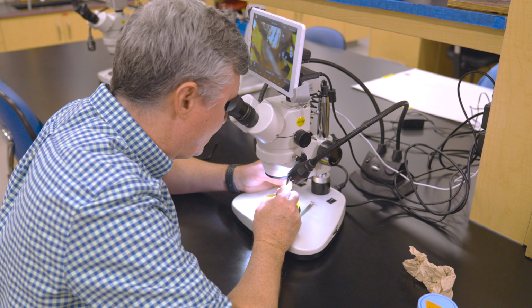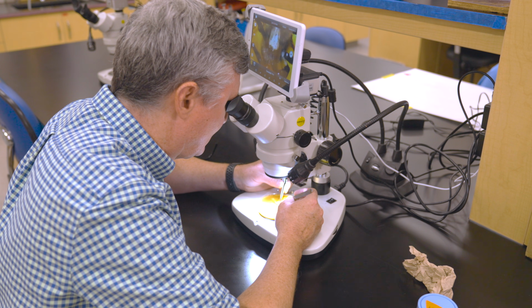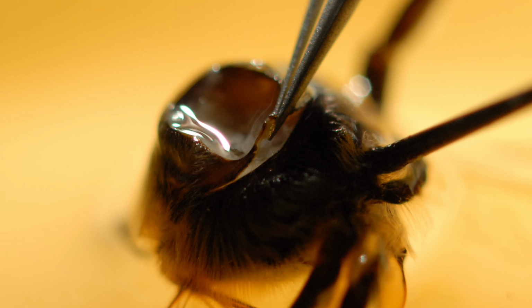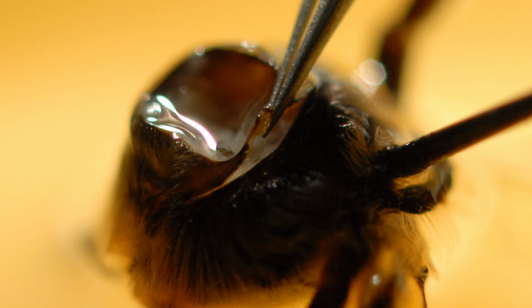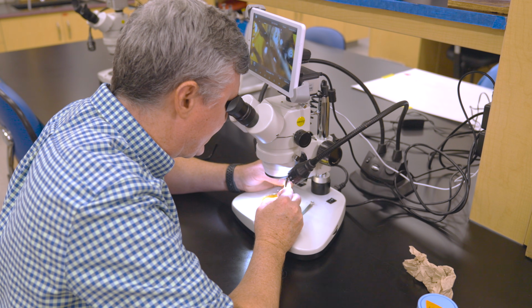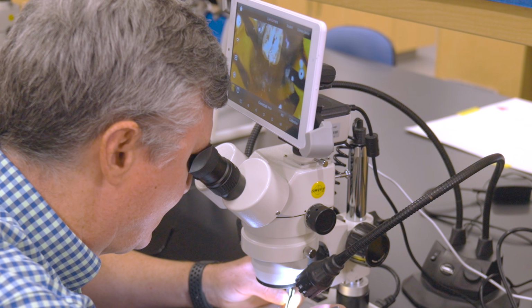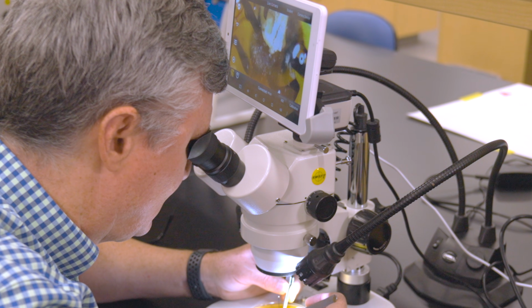With that opening available and that first pair of legs removed, the thorax has what we call a collar. It is a section of exoskeleton that rings the opening of the thorax that you can see. So with both pairs of tweezers, you are grabbing the base of that ring and slowly peeling that ring off in both directions from the thorax.